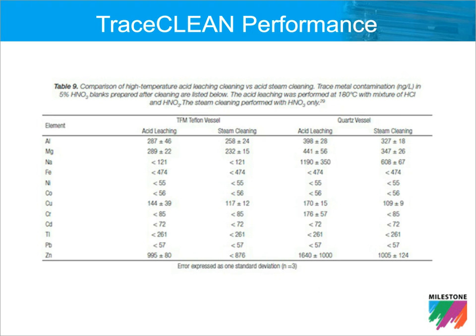Here's an interesting slide that compares the data from doing the traditional approach of acid leaching versus steam cleaning in a TraceCLEAN of both Teflon microwave vessels, as well as the quartz vessels or the quartz inserts that Dr. Nobrega talked about earlier. As you can see from the data, the steam cleaning is as effective, if not more effective, than the acid leaching traditional process of doing this.